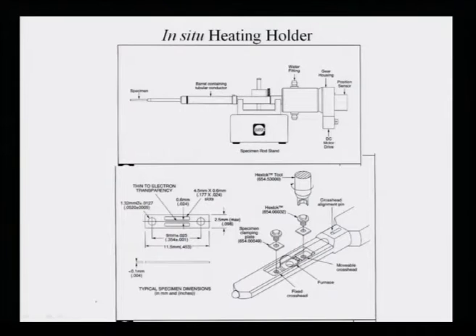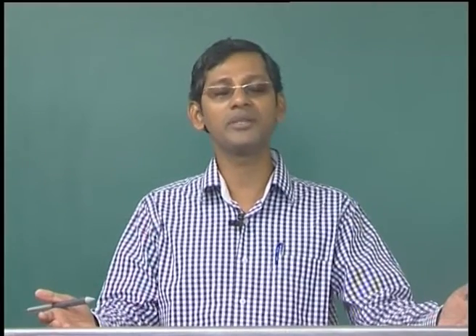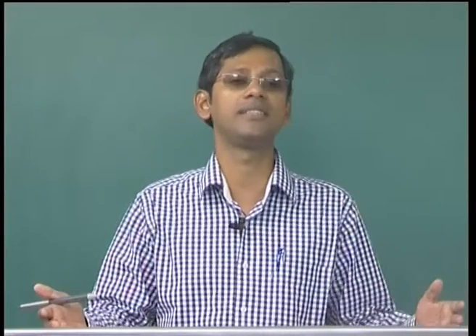So, first of all, let me just tell you about a heating experiment. Normally a heating experiment is done using a heating holder. The first thing you understand from this experiment is that the TEM remains the same, the only thing we are changing is the holder. So, if you have different sets of holders, one can run different kinds of experiments inside any TEM available in this world. You do not need a special setup for this TEM.